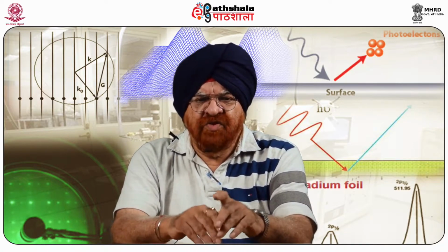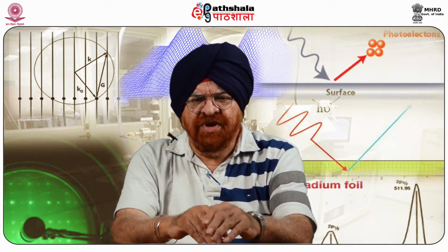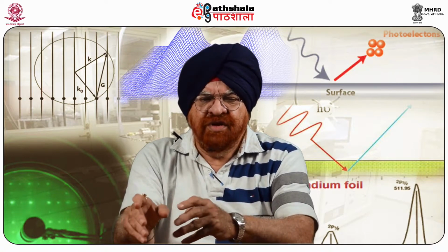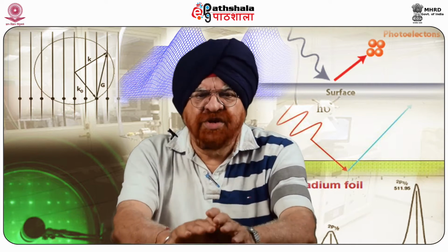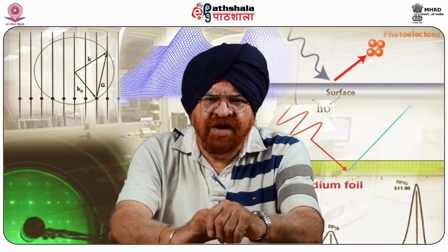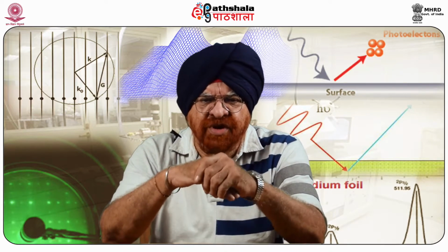But here, we have both high resolution and high sensitivity, and performance in ambient conditions is required in order to study biologically relevant samples. So that means this, in addition to giving high resolution and high sensitivity, can be a very useful technique for analyzing biologically relevant samples which will have ambient conditions.